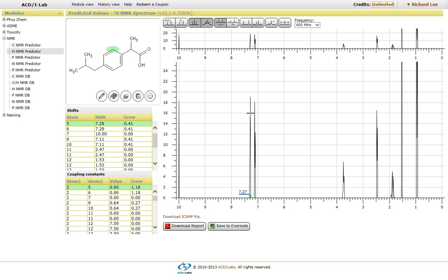you'll notice that it has actually highlighted the proton that it corresponds to, as well as the chemical shift and atom number, as well as the coupling constants associated with it.